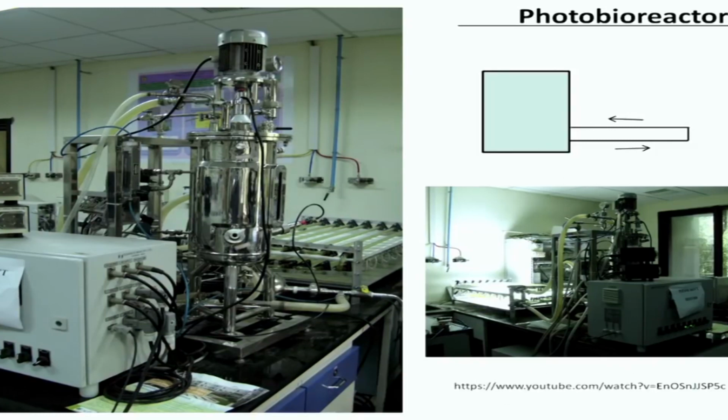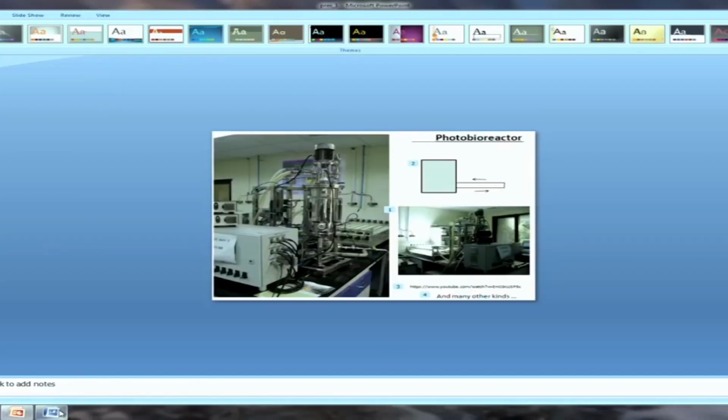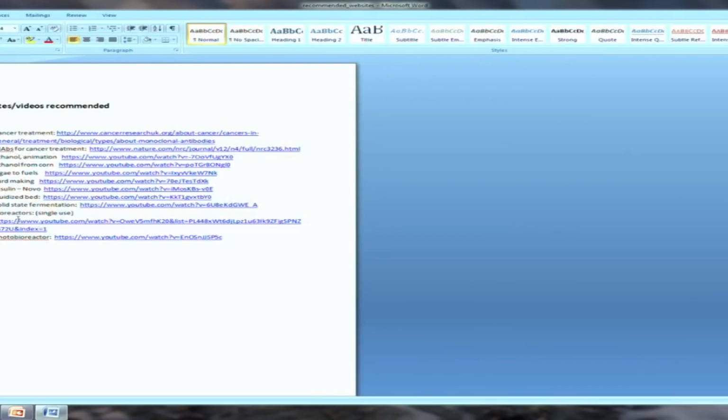This is a video that you could watch from that list that is taken there. I think it is number 11 here, the photobioreactor. That would give you an idea as to how it is possible to produce bio oil from microalgae through a bioprocess that involves a bioreactor.